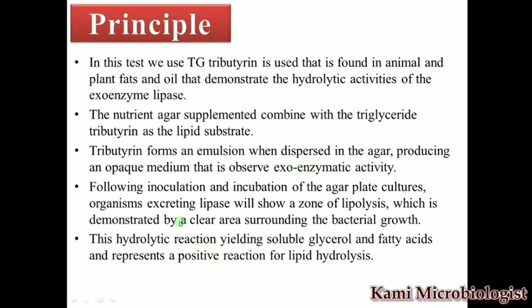Another point says that when we perform the inoculation and incubation, what we actually observe is the bacteria secreting the lipase enzyme, which can degrade the lipid, and after that lipolysis will occur and we get the zone of lipolysis.